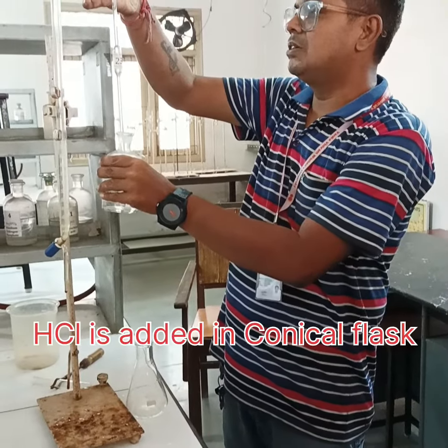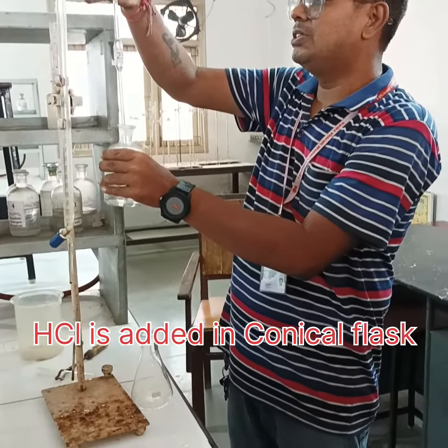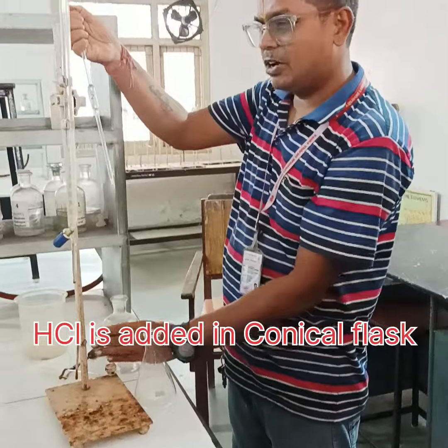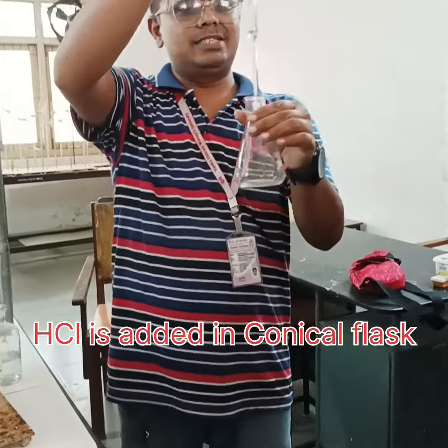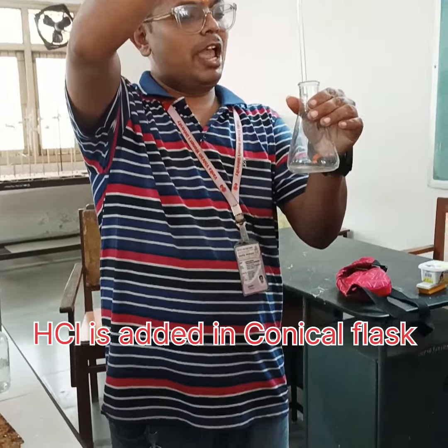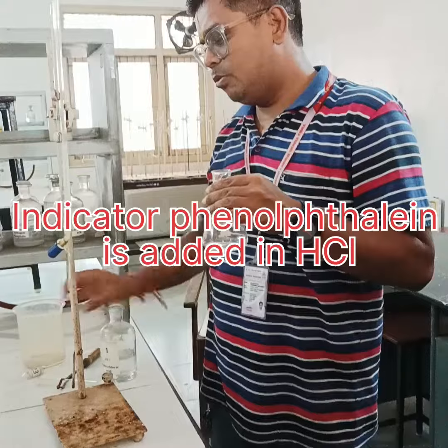I want precision. Everywhere precision is needed, even one drop of precision. You know, if a doctor gives one medicine a little bit extra, then there are problems. I take HCl here. How much ml? Exactly 10 ml.